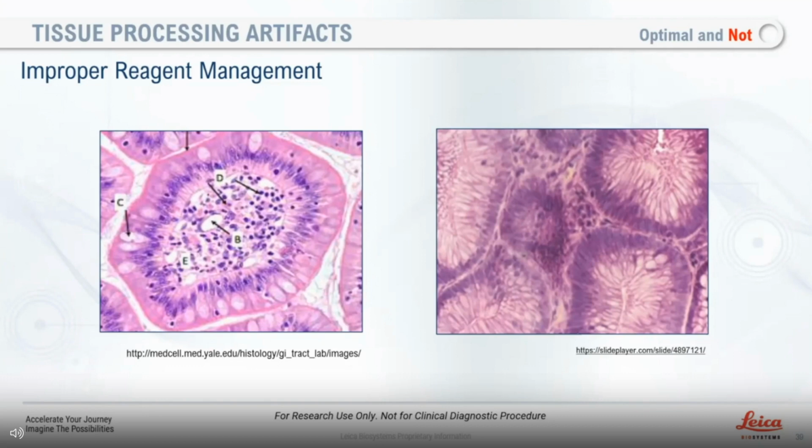Some of the common problems with hematoxylin staining: usually we have a little diluted acid rinse after water, and then we go into the bluing. But it depends how fresh your hematoxylin is, right? How much time you have on that. And because it is a regressive stain and you use a diluted acid to clean it up, is that too strong, right? Again, you'd have to look at the slide to be sure.